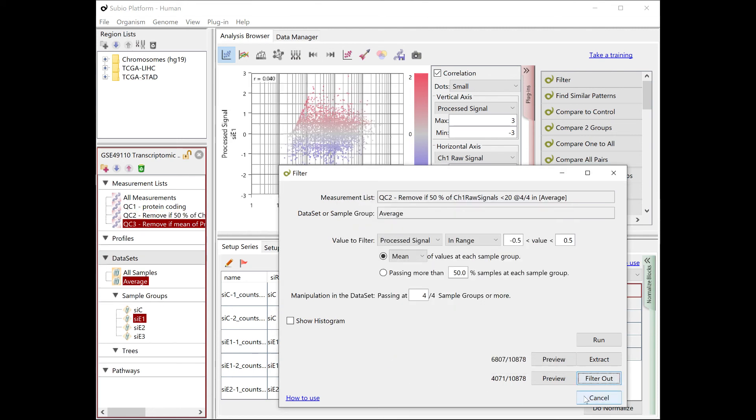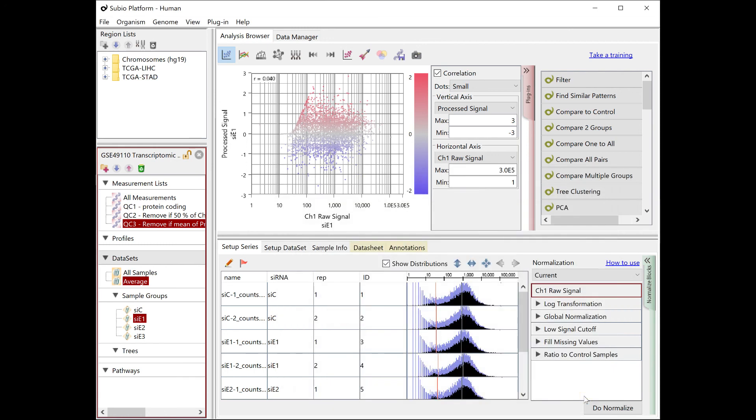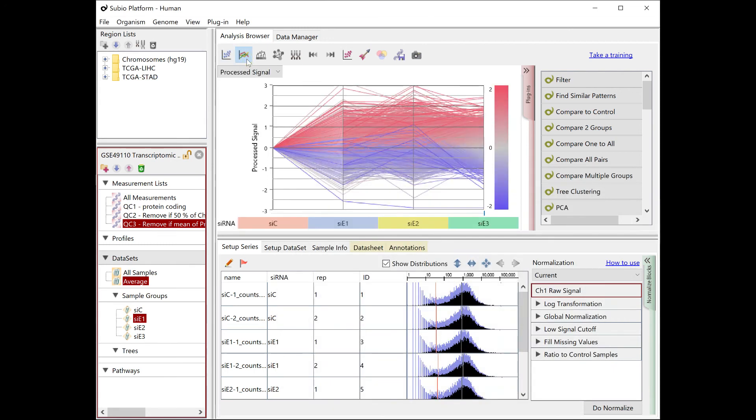Now you've eliminated genes that are a hindrance to the analysis, and the data is ready for analysis.